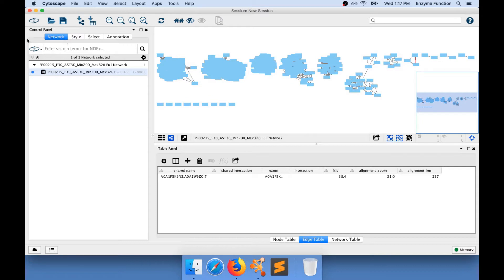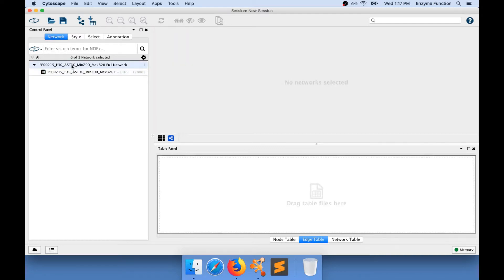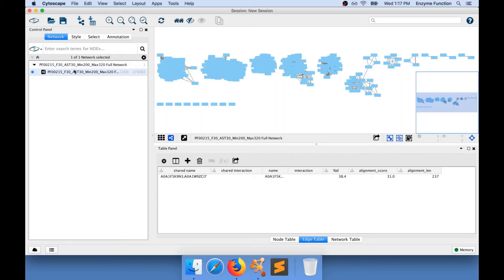In Cytoscape, you also have the control panel. By default, you are in the network panel for the control panel, which allows you to select which network you are working on. Right now, I only have one network open, and this is the only one displayed.